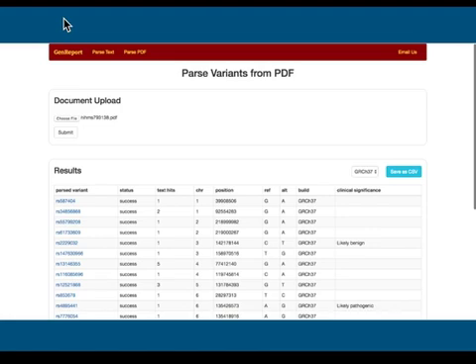Any questions? I have a quick question. Sure. Your clinical significance column, which database are you scraping the data from? That's from NCBI. So right now it's just coming from ClinVar. That's definitely a piece that we would look to develop out more and customize. That was kind of the basis for this first run. Yeah, this is very much kind of prototype or beta.